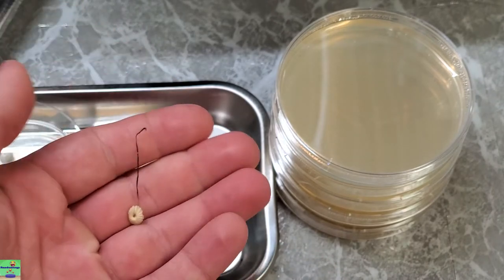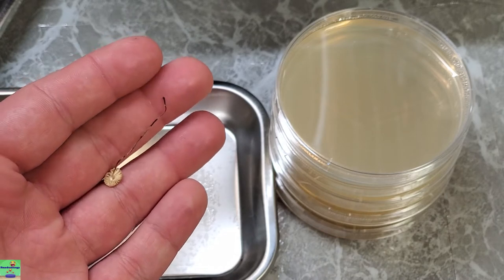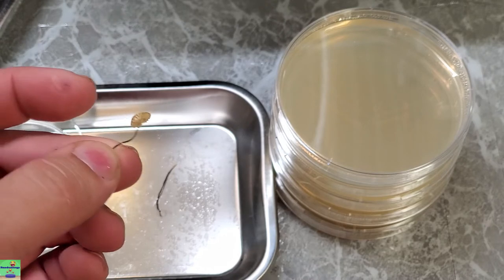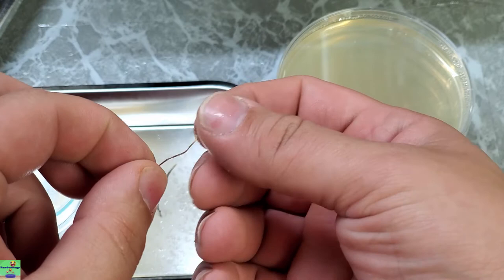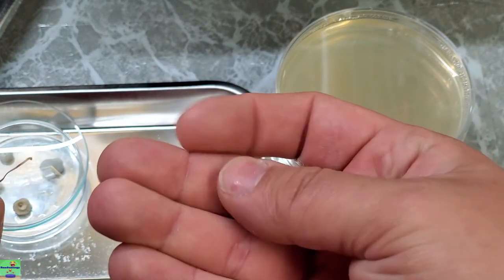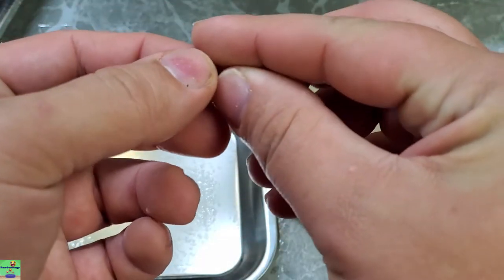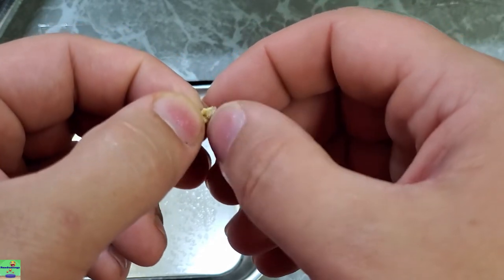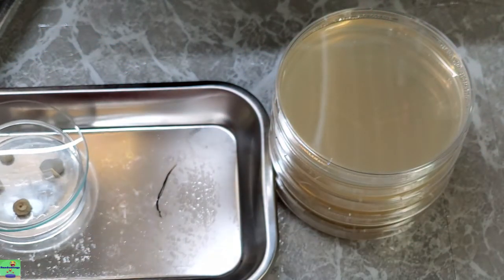As far as edibility goes, in case anyone was wondering, they're not considered toxic or anything from what I've read. They're just not worth it, because for one, they're just absolutely tiny, so you'd need a pile of them. But also, if you handle one of these, they're very, very robust. I don't think that chewing them would be a pleasant experience. I really don't. But yeah, that's how I do a spore print.